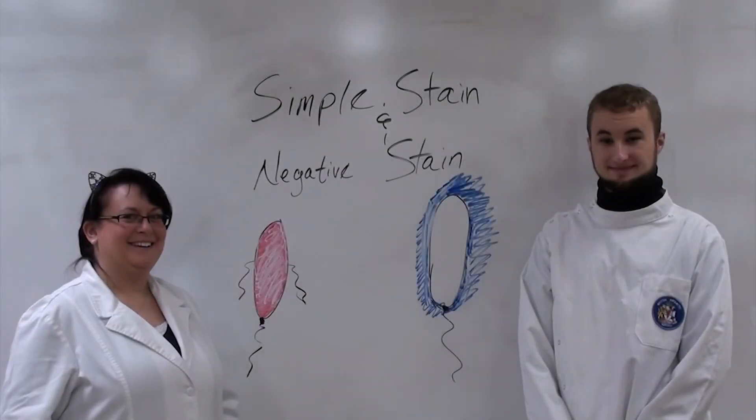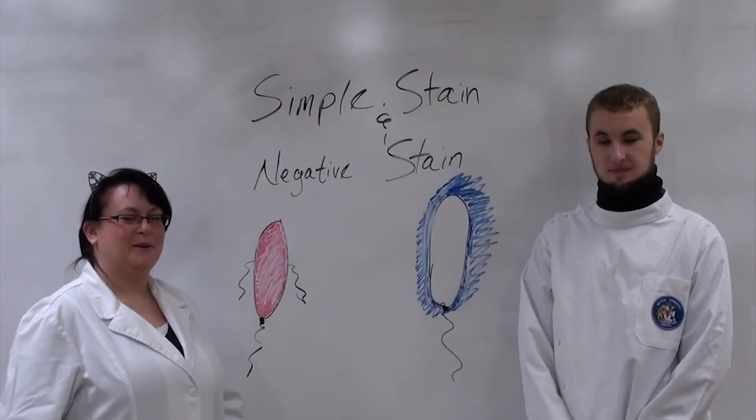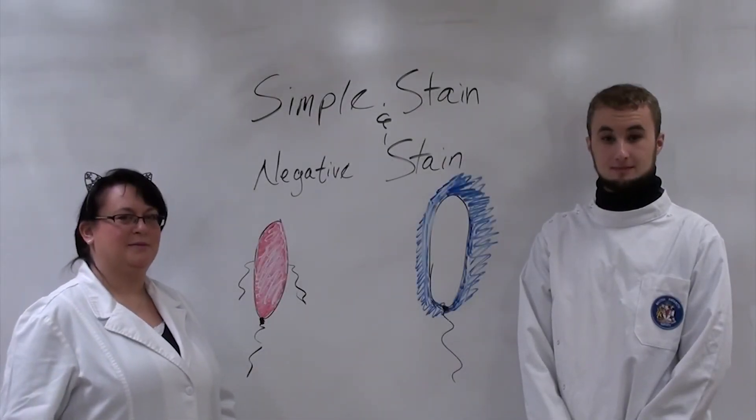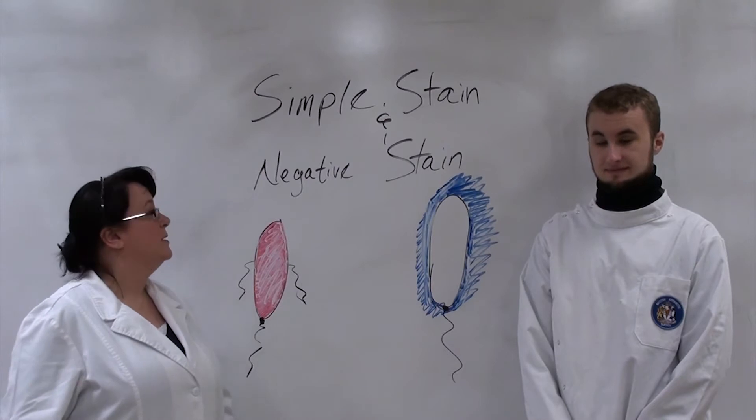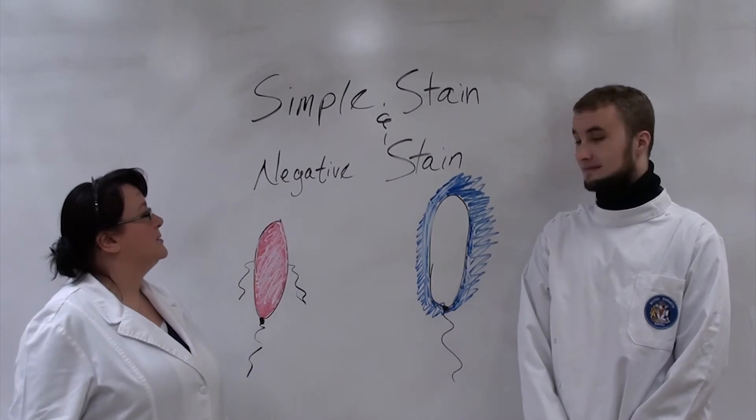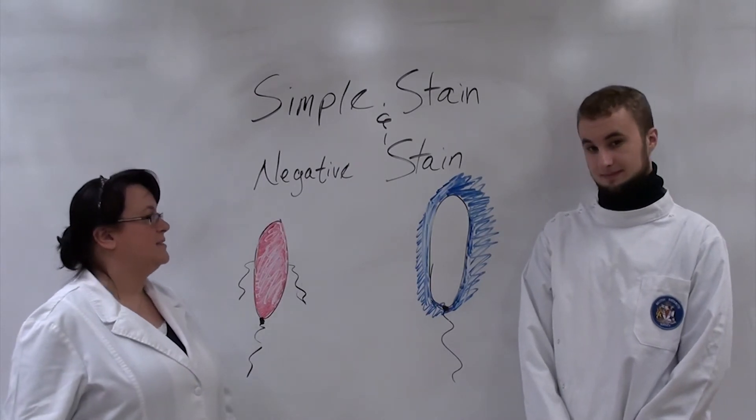Welcome back! In this video we're going to be doing two very basic stains: a simple stain and a negative stain.